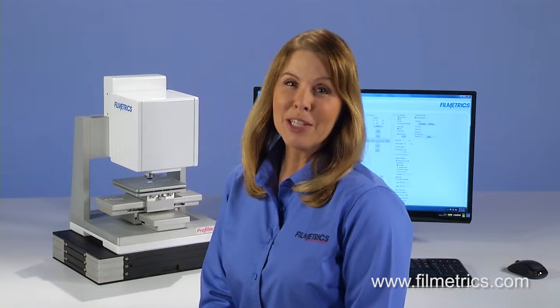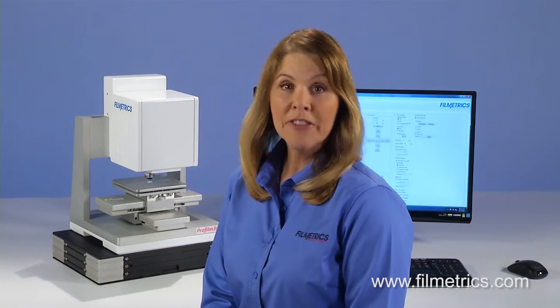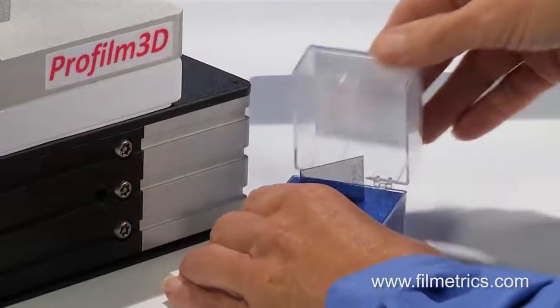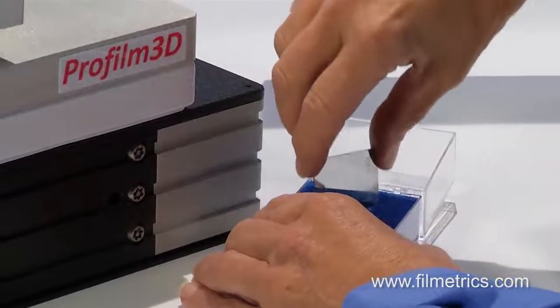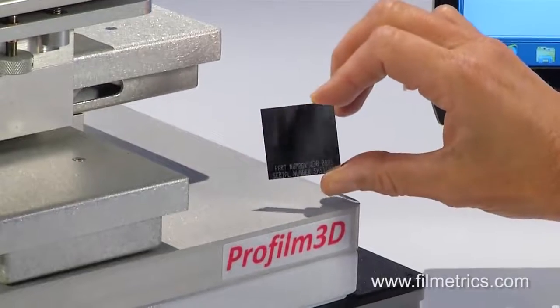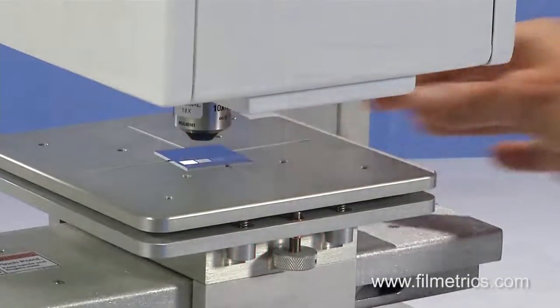Hello, I'm Jodina from Filmetrics. I'd like to show you how easy it is to make a measurement with the Profilm 3D. The Filmetrics step height standard has several features of interest and is used to calibrate the Profilm 3D. This demo will be looking at a single step feature on the standard. Let's have a look.